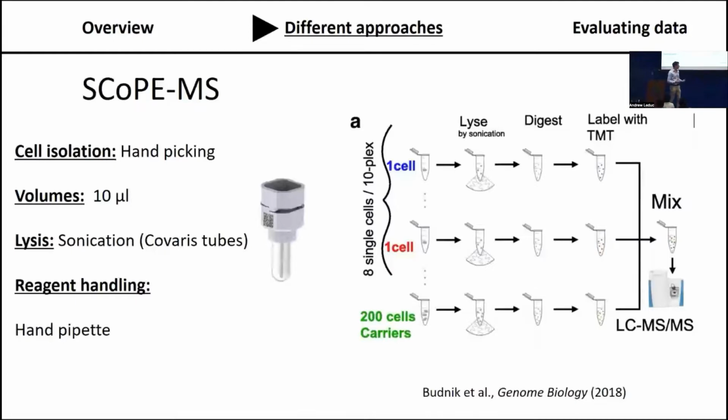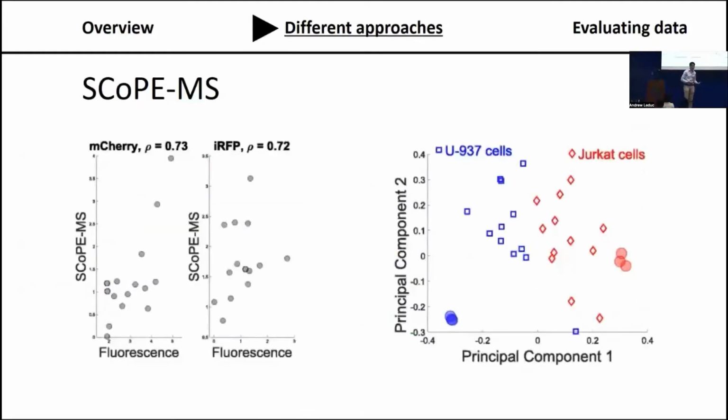And like I said, this work provided a nice proof of principle for single cell proteomics for us, allowing us to kind of finally analyze small cells. Here we're showing some monocytes and T cell lines, and also have measurements that were validated externally by different metrics such as fluorescence. But again, of course, taking every single cell individually and lysing them one at a time is not very scalable if we're interested in preparing thousands of cells.